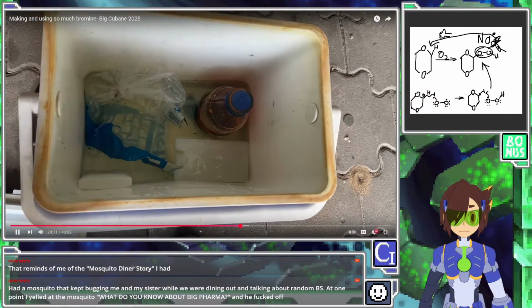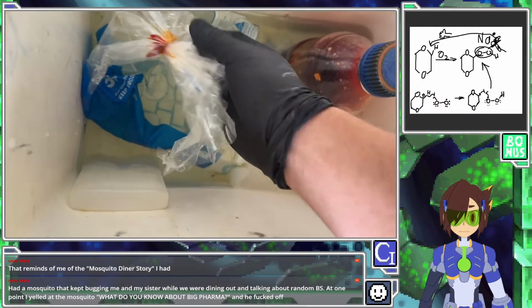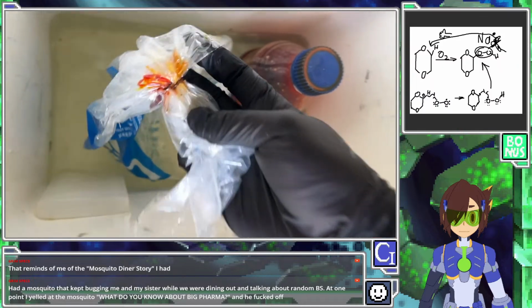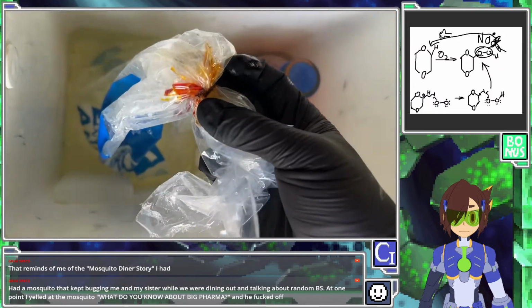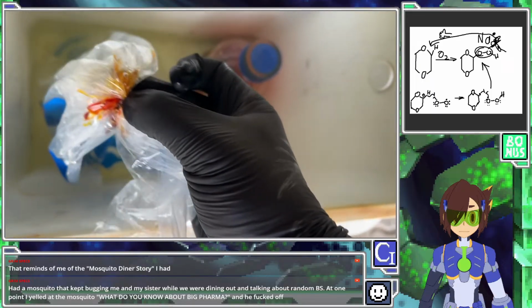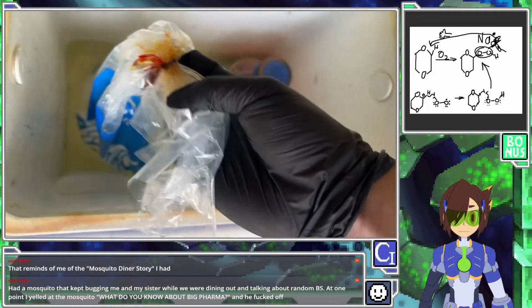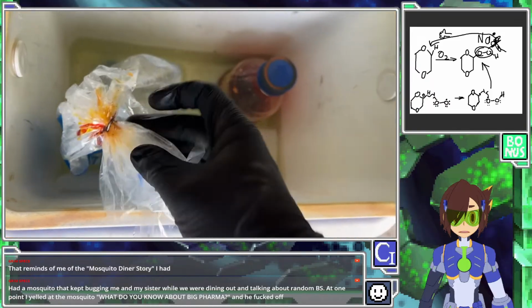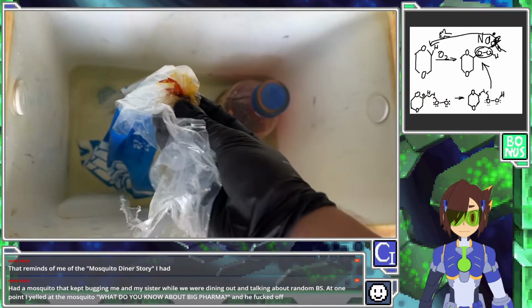Would take on this sort of moldy piss smell and be generally very unhealthy to eat. One interesting thing here, it looks like the bromine sort of collected around this neck of this plastic bag here, which used to have ice in it. But actually, I think there's a little tie and there's maybe some steel in it. The bromine has corroded the steel so badly that it's leaking all iron bromides in there. So there was one tiny bit of metal in this whole thing, and you can see how aggressively corroded it is in about 2 weeks.